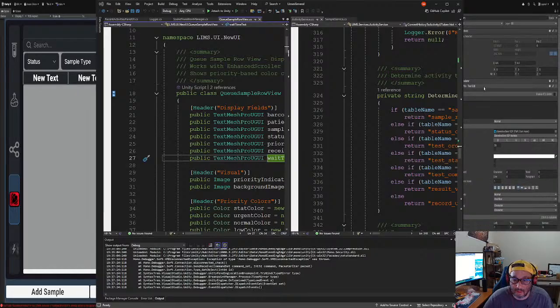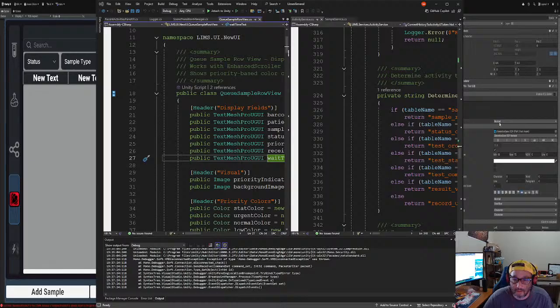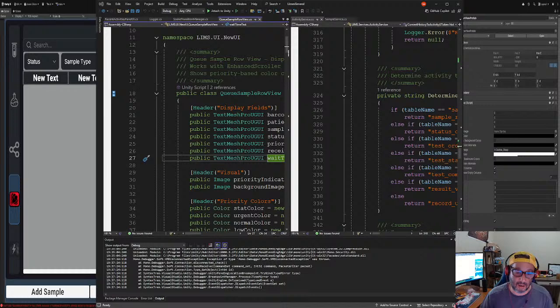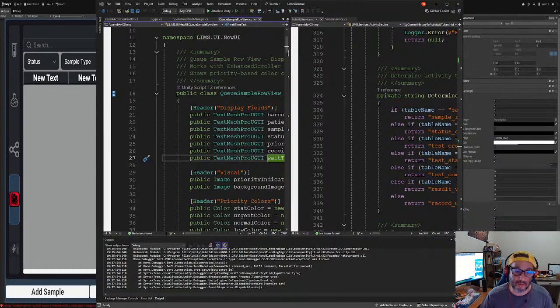paste, paste, paste, paste, and then paste, and then paste. Told you, software development, it's tedious. All right, so save this as a prefab again, unpack as a prefab, and then rename this as a header.